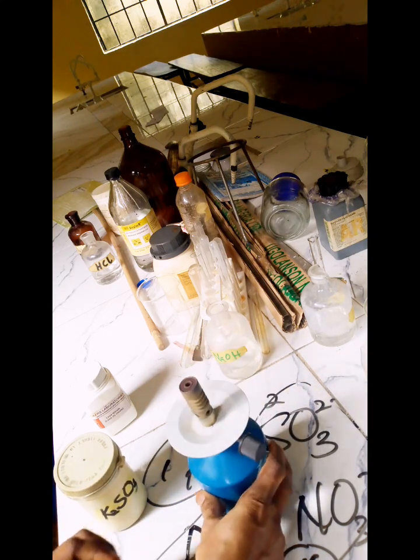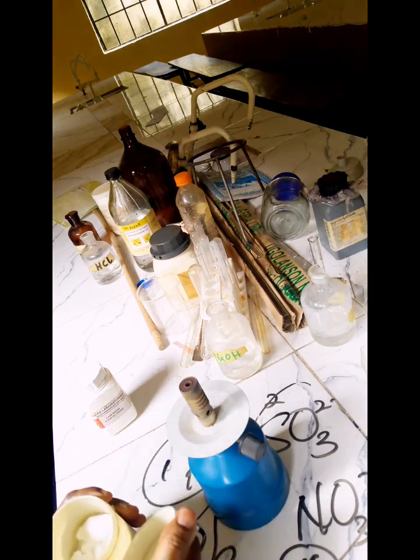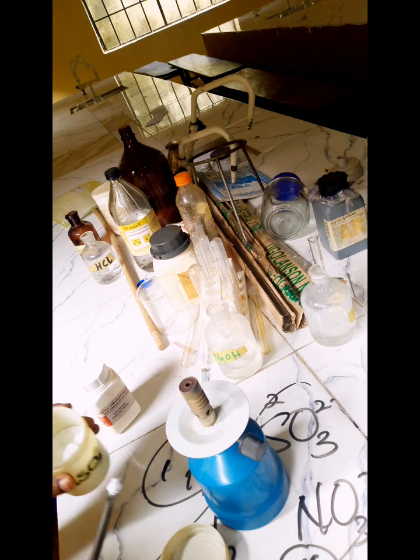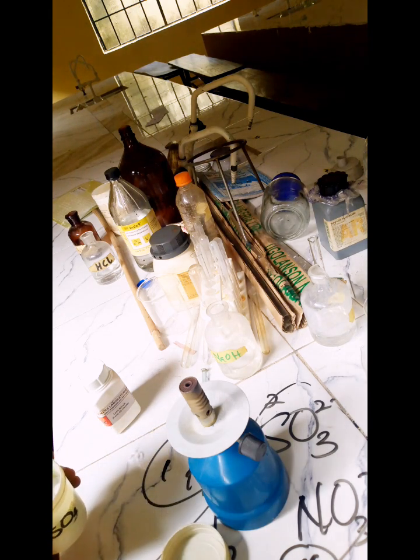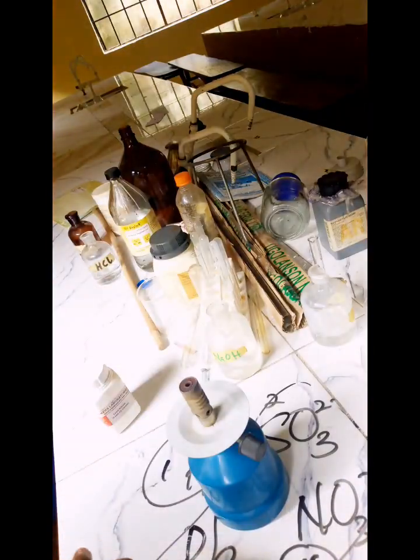Let us collect some sample of the salt. Here is the salt. Let's drop a sample of the salt here.